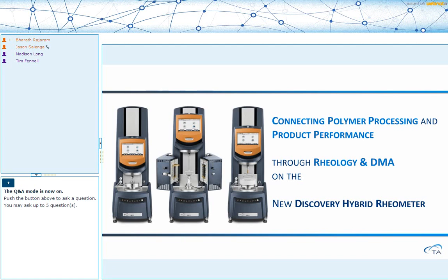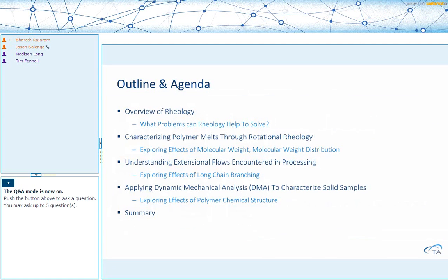Thank you, Jason. Hello and welcome everyone to today's webinar that focuses on polymer processing and product performance and how you can quantify that through rheology and DMA measurements. Start by looking at a quick overview of what rheology is and what kind of problems it can help to solve in your lab, and then dive right into how you can characterize polymer melts through rotational rheology, specifically looking at effects of molecular weight and molecular weight distribution.